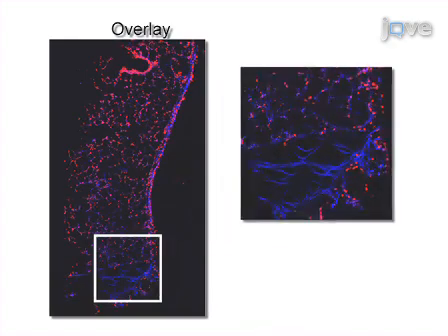This figure shows an overlay of the two channels, with a close-up of the boxed area of the tissue shown here.